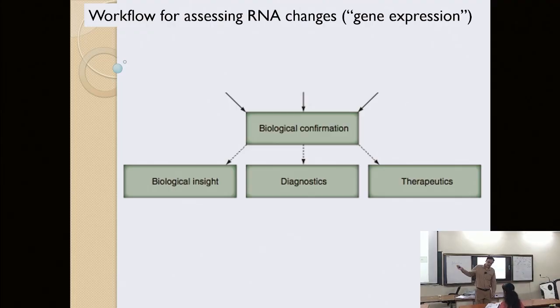RNA-seq can, so this is the workflow. So starting with the RNA. So starting with the biological question and then design and then so on. Okay, and you come to the end here.